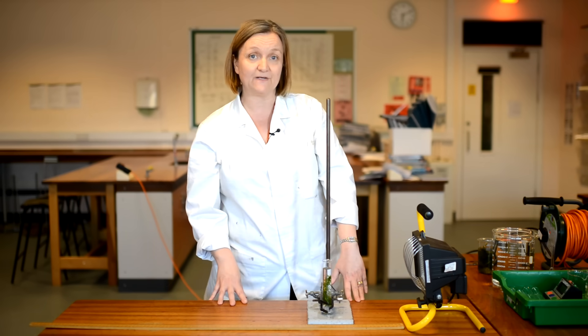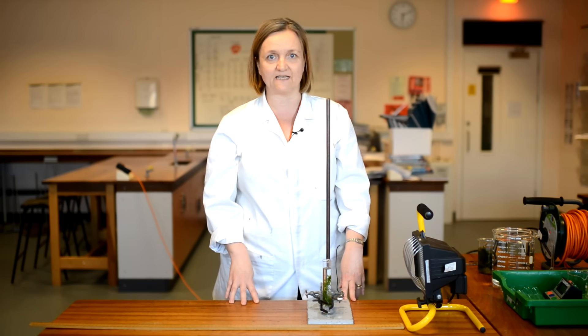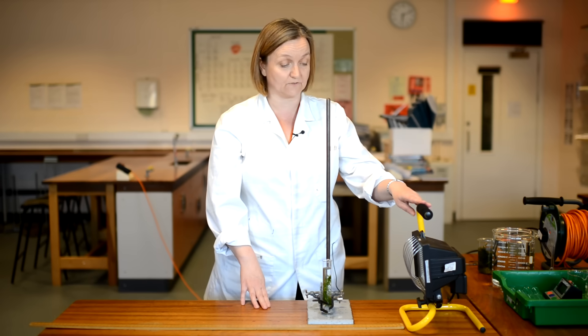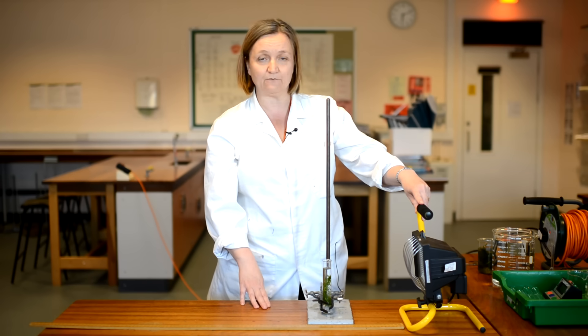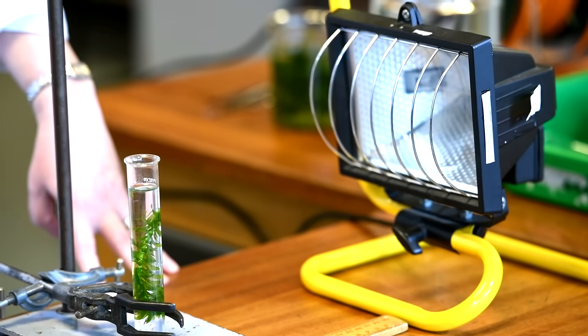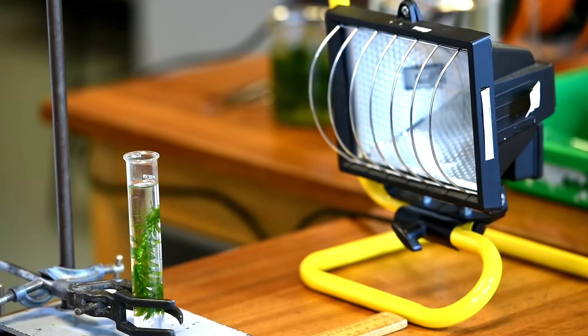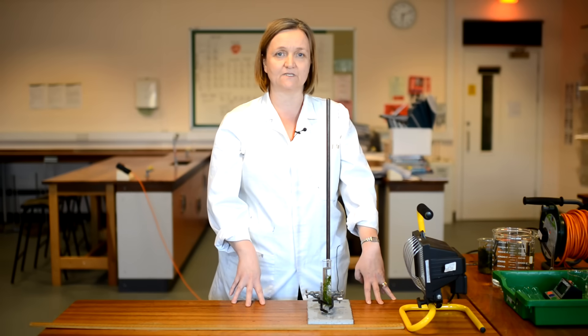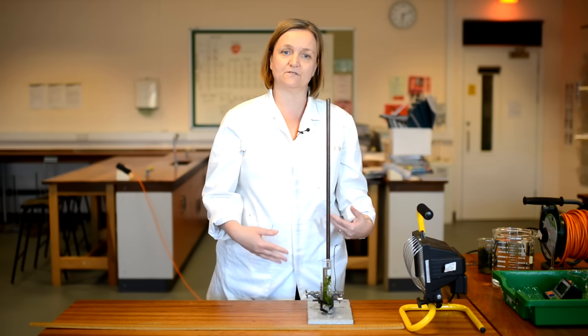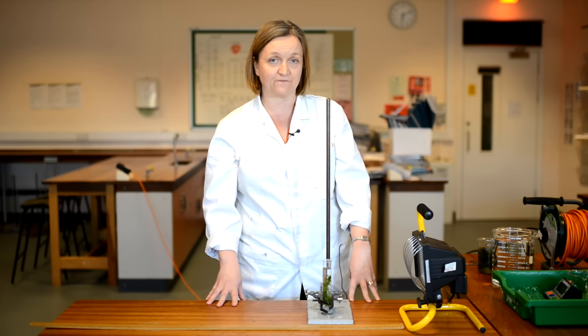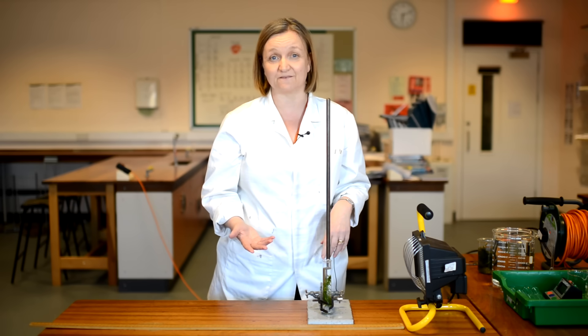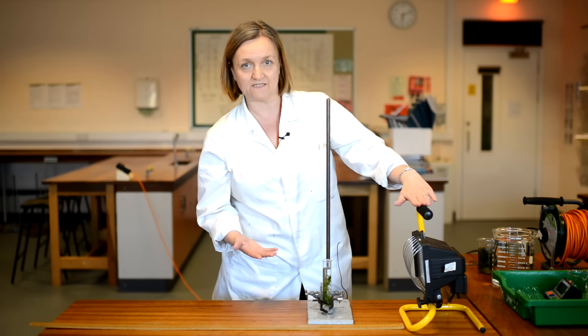So the independent variable is going to be our light intensity. And to change that, we're going to change the distance between our pond weed and our light source. Now, I'm using quite a powerful light bulb here, but actually it may be better, and you may have done this at school, to use an LED light source. This is because the LED sources don't give off very much heat energy. And, of course, because the temperature will also affect the rate of the photosynthesis, we don't want to have two variables changing at once because that would make the test unfair. But this is the one I'm using today, and so this is the one I'm going to investigate.